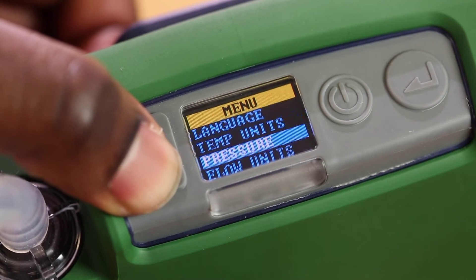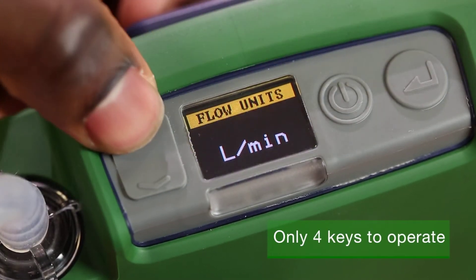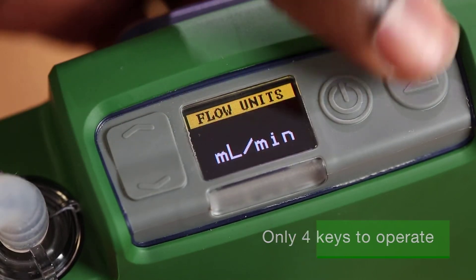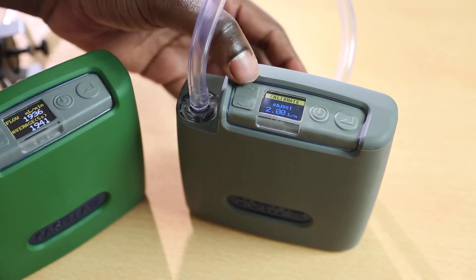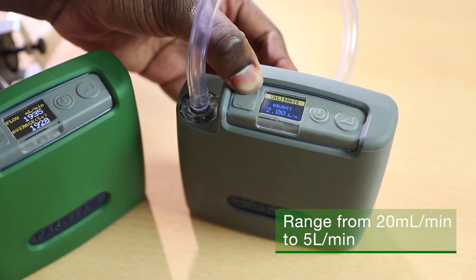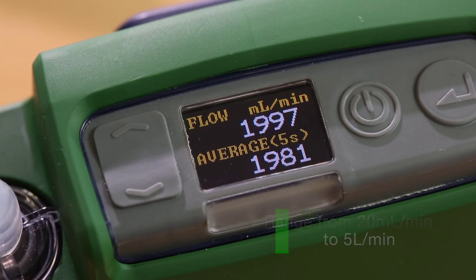With its colour screen and simple menu structure, the Flow Detective is very simple and quick to use, saving time when setting up air sampling pumps. Having a calibration range to suit sorbent tube sampling at low flows through to respirable and inhalable sampling, the Flow Detective gives instantaneous flow measurement for quick calibrations.